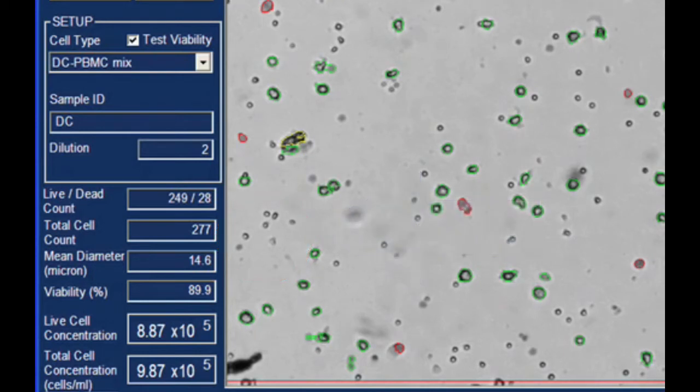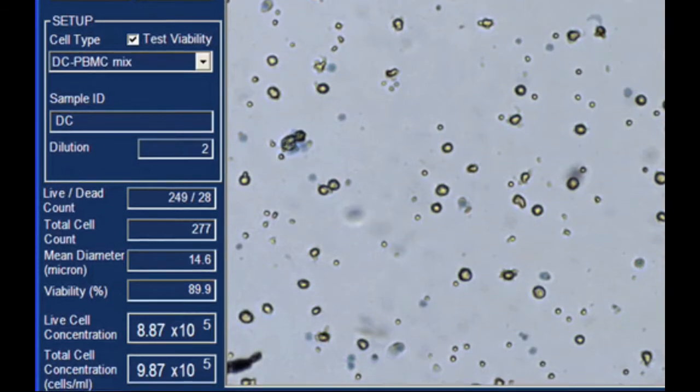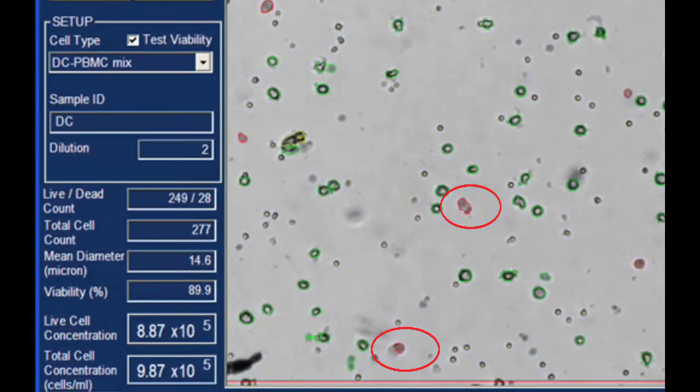Because the TriPan Blue dye is only permeable to cells with compromised cell membranes, Cellometer software counts darker cells stained with TriPan Blue for the dead cell count and percent viability determination.